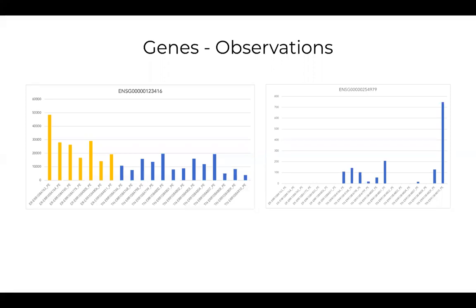That's how you can differentiate that one gene. In all of the samples, one gene has very high expression in ER and in some others a low expression, and in triple negative you saw otherwise. So we are looking to find something like this from our data.